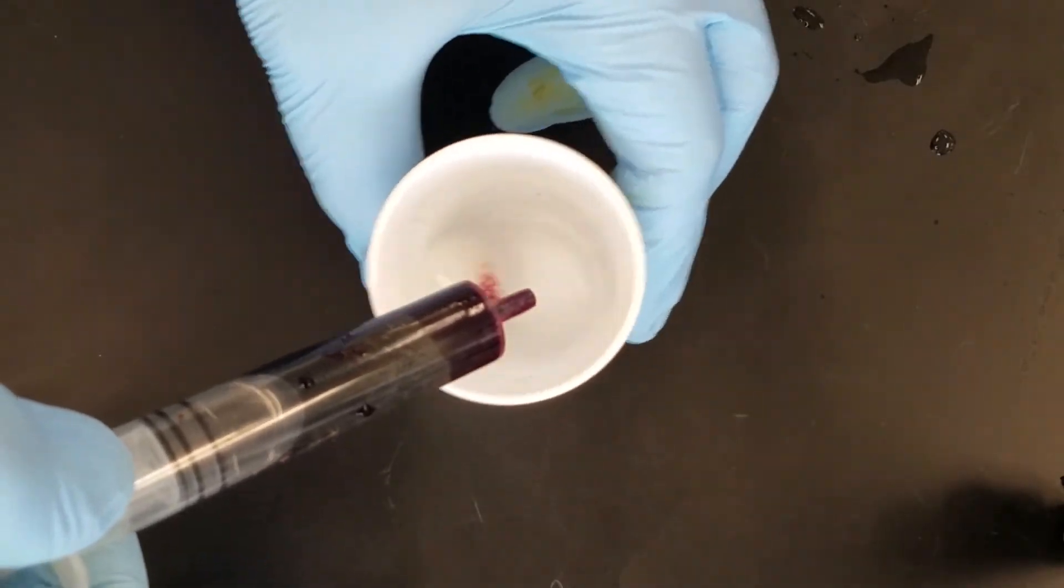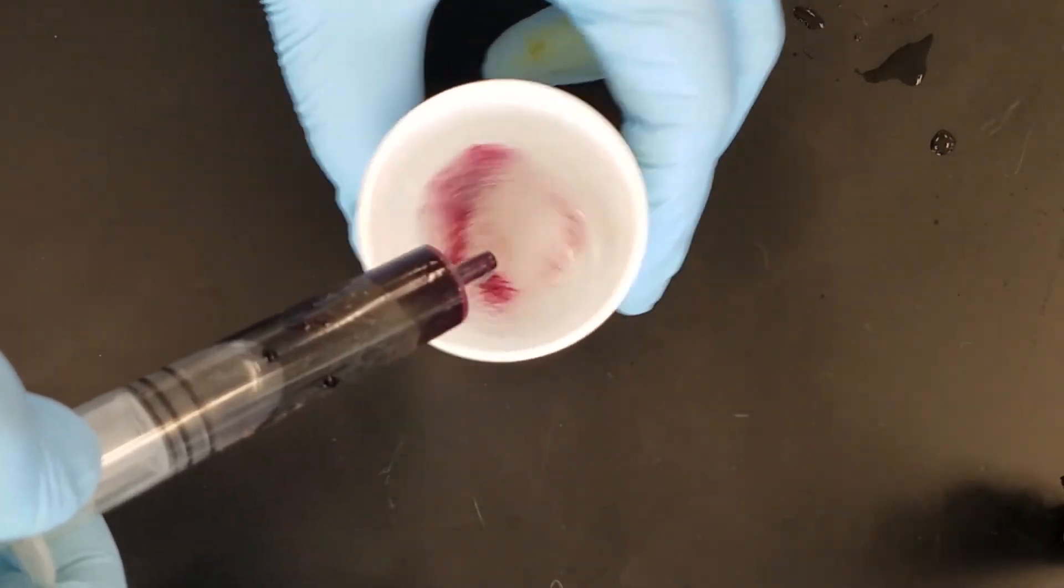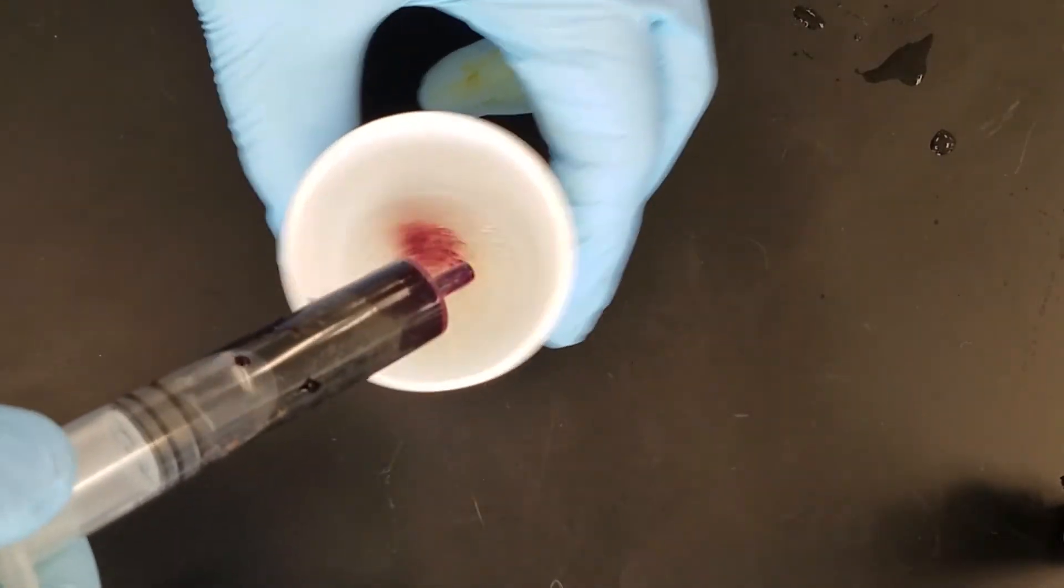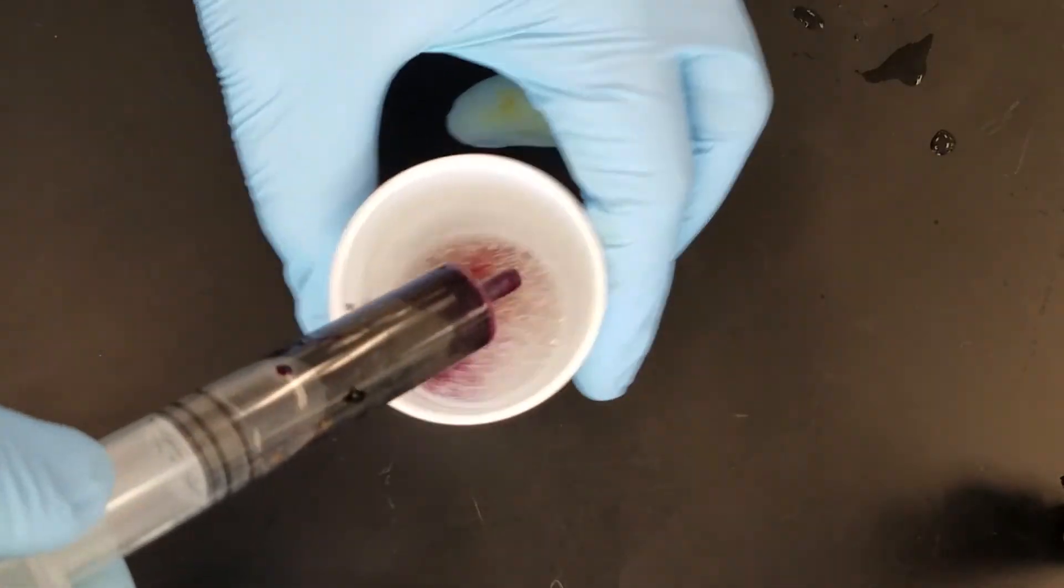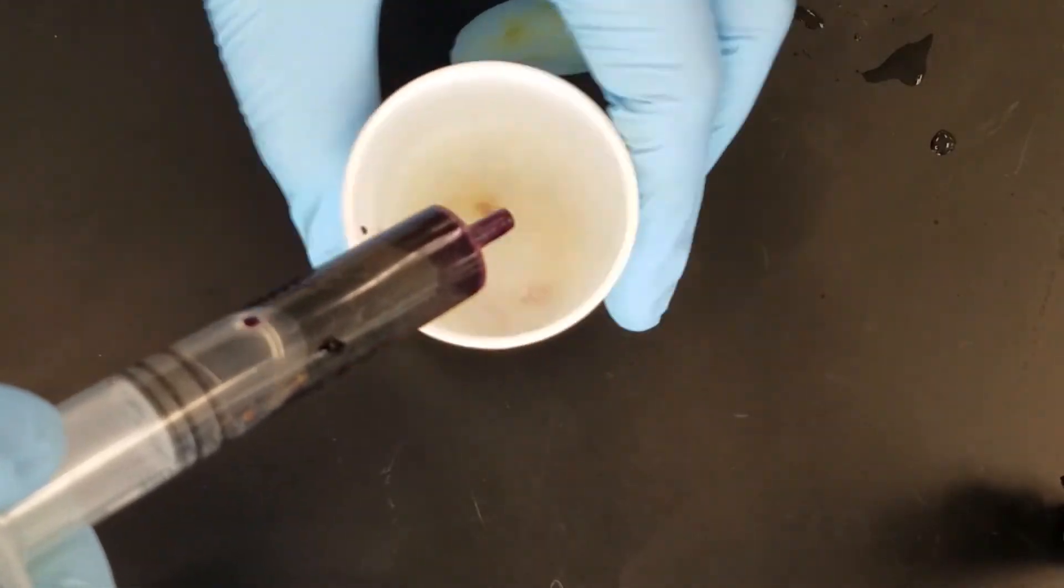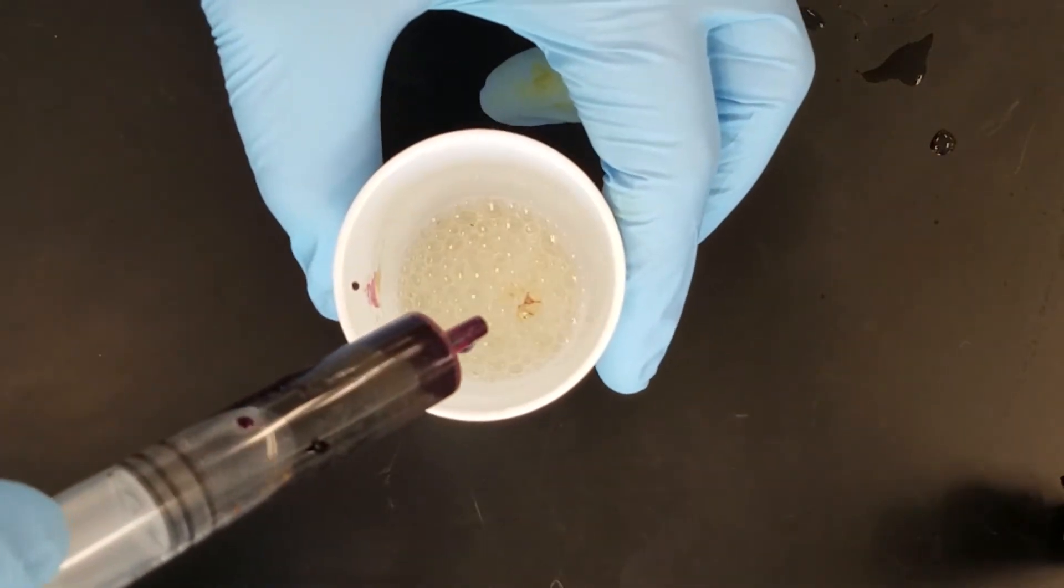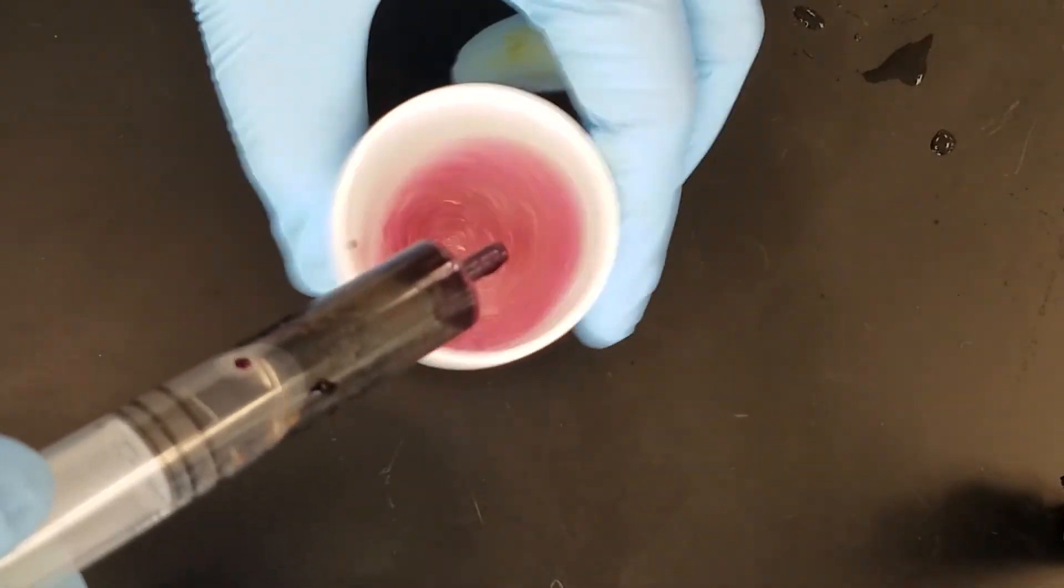The key is to keep it swishing around and you're going to notice it's going to change color a little bit. Keep swishing it around and it'll turn a little brown, but keep swishing it. Eventually it'll clear up.